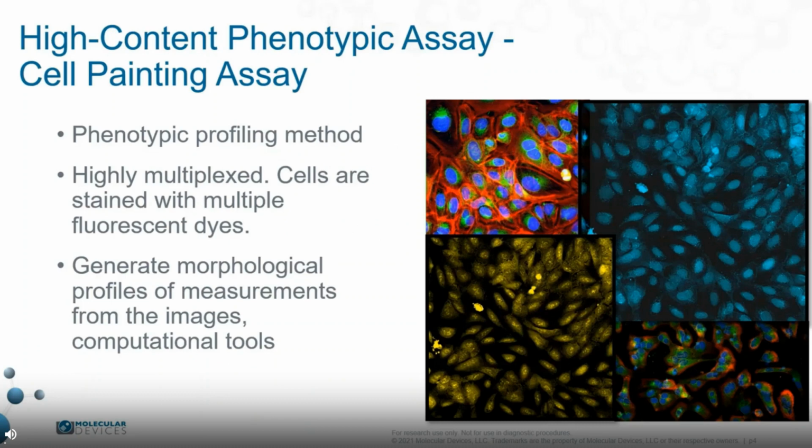So to get things started, I'm going to kick off this presentation with an introduction to cell painting. So what is cell painting? This is a phenotypic image-based profiling method that has widespread applications in drug discovery and also in functional genomic studies. It was initially developed and optimized at the Broad Institute and in Carpenter's lab. And the aim of cell painting is to visually represent as much of the cell as possible.